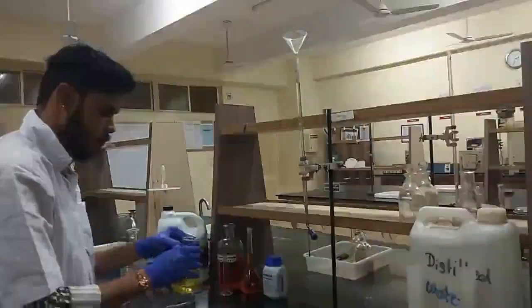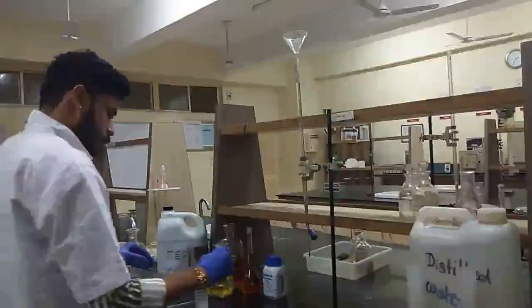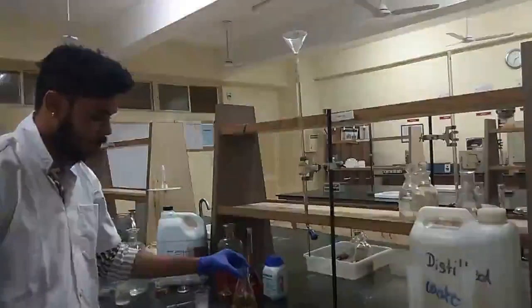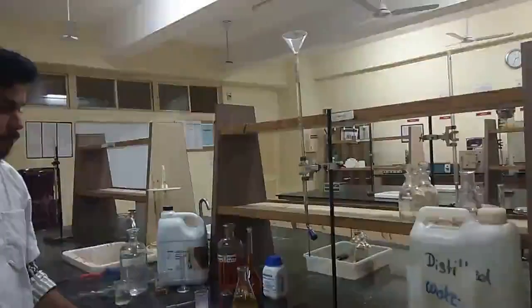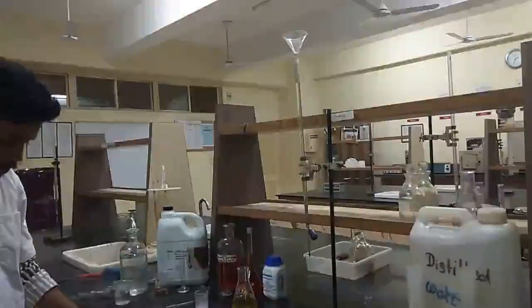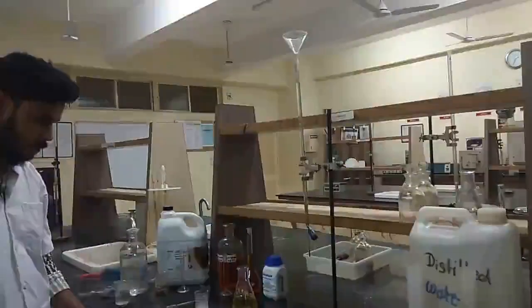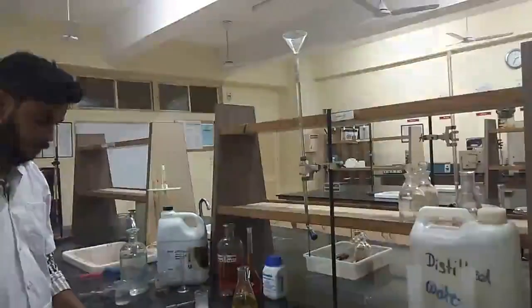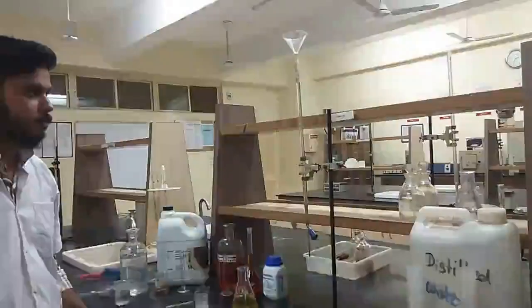Right? Now after addition of this 100 ml of distilled water, we should wait for the next 5 minutes, because the reaction is slow, and it helps the reaction to take place properly. If the reaction is completely done, there is a release of free iodine after 5 minutes. This is a slow reaction, so we are going to wait for 5 minutes.